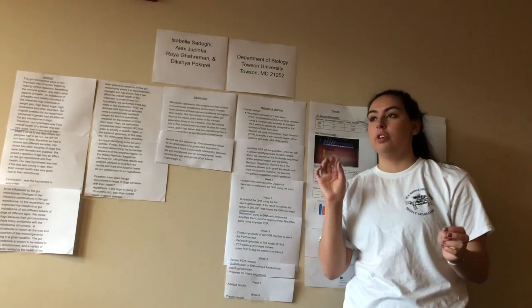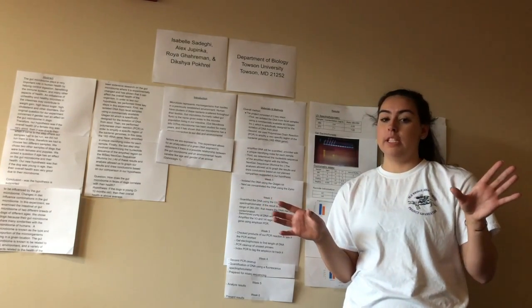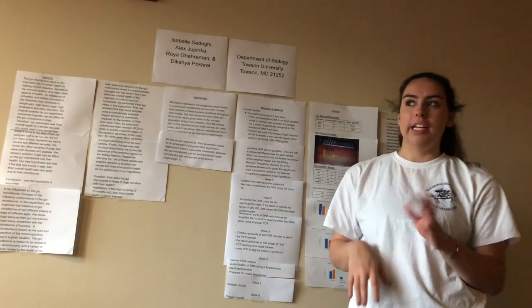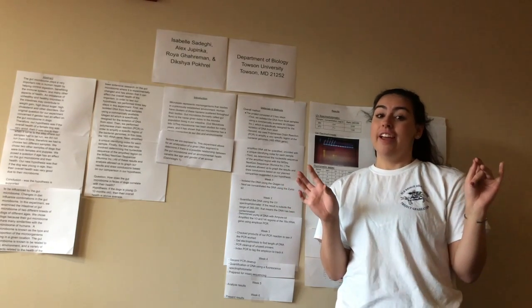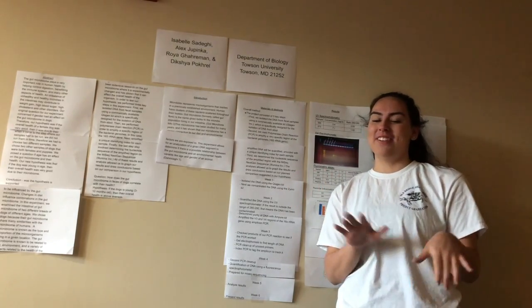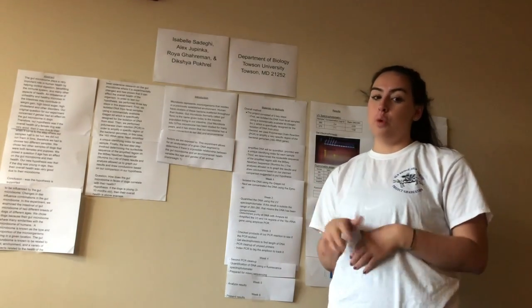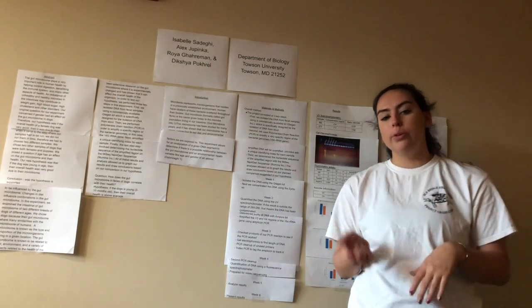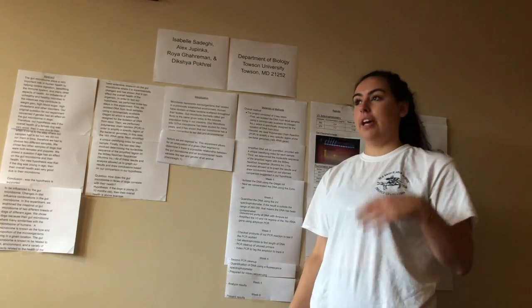So discussing the number of reads of the positive control. Most organisms found in our samples were unidentified organisms, at about 0.5%. However, Blautia hydrogenotrophica was an identified organism found in our samples at about 5%. Blautia is a bacteria found in the normal gut microbiome that helps process sugars like lactose, fructose, or glucose, and even indigestible materials such as plant matter.